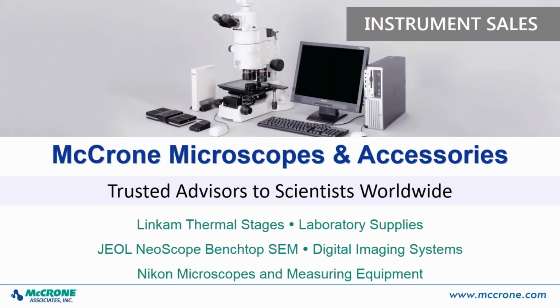So if you dissolve a sample or melt a sample or the sample sublimes, yes, you destroy the sample. The good news is, since you're doing this on a microscope slide and using the microscope to detect the result, you only have to use a very, very small sample size. We're talking about nanograms or even picogram samples. So hopefully in most cases, that would be just a very small portion of the sample that you have available.